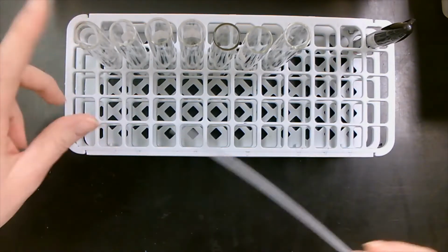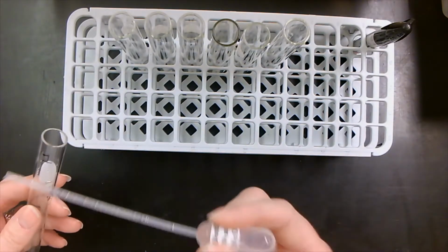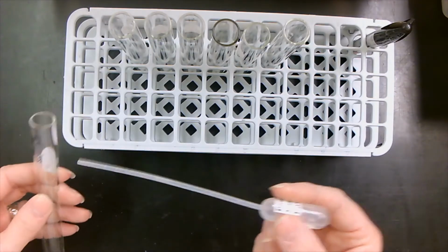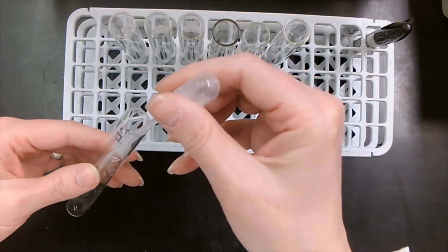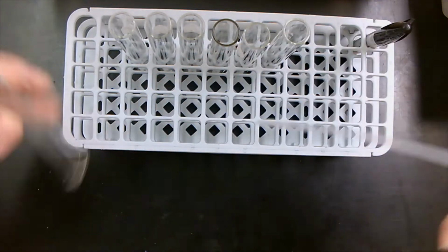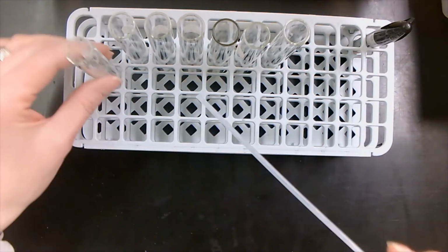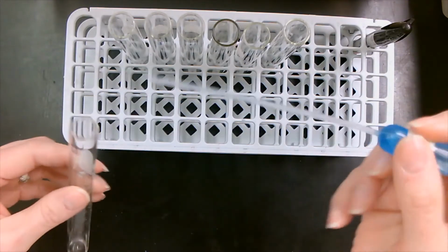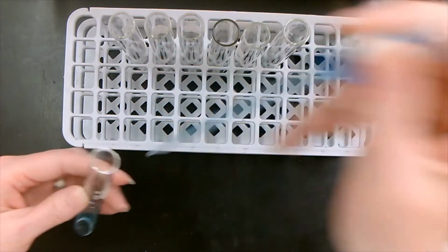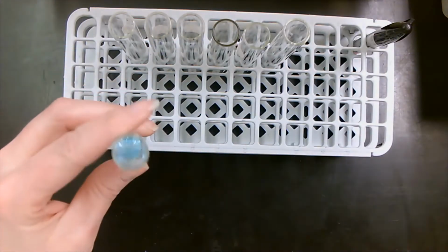For the first test tube, we're going to be adding distilled water. The reason why we test distilled water is that we know that distilled water does not contain any glucose, so therefore this is going to be our negative control. Adding 5 drops. Next, for this test tube, I'm going to be adding 5 drops of Benedict's. So now we can see a bright blue solution.